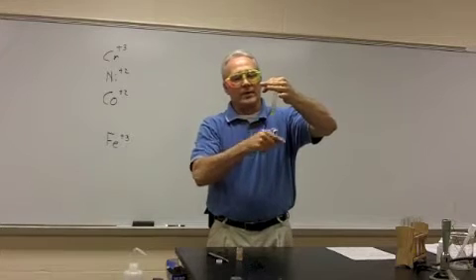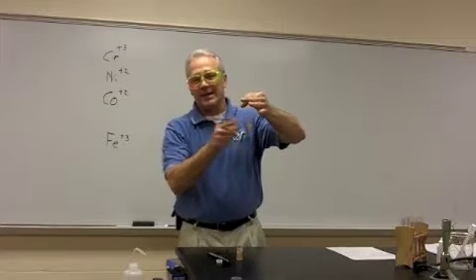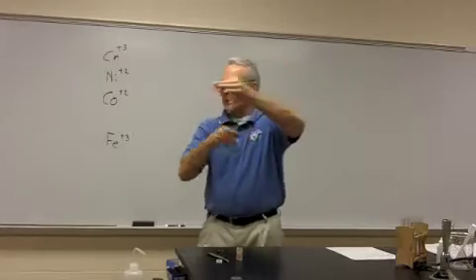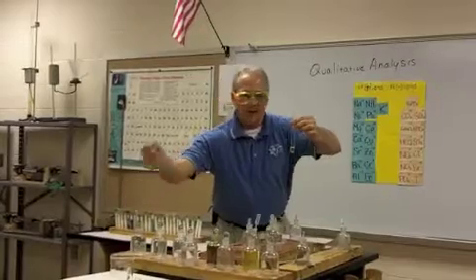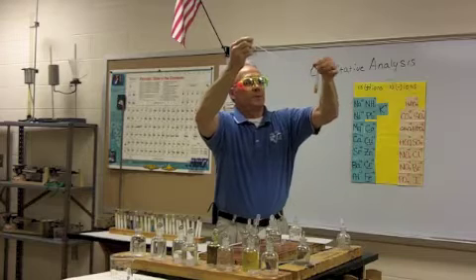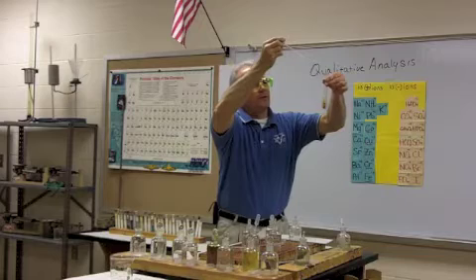So what we're looking for here is the formation of a precipitate, and whether the precipitate stays or goes away with additional drops. So we'll go ahead and follow that process. Here it's completely dissolved. Go ahead and add our sodium hydroxide. I'll add the first drop. We do get a precipitate forming. We see a color change there. Now I want to see if that precipitate stays or goes away.